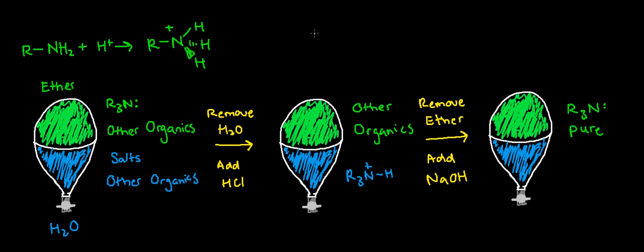So say we've got A in equilibrium with B, and to keep it simple, say it's 50%. So half of it's A, half of it's B. Let's say A is in the ether phase and B is in the water phase. If I pour out all the water and then add some fresh water, all of B will be gone, but since it's in equilibrium, once more water is there, 50% of A will become B. So I'm going to have more stuff in there.